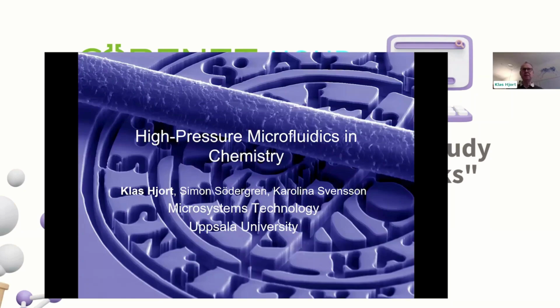So, thank you for inviting me, and it's a pleasure to be here and talk about high pressure microfluidics and chemistry. Just like Manuel said, this is nothing you do with PDMS. You need a stiffer and stronger material, very often using silicon, and you're using the mature technologies that have been developed. You have to remember, in miniaturized and microsystem technologies, all the sensors and actuators, well, at least more than 90% today are made in silicon, although most of us in science and engineering at the universities work with other materials. So my background is a material scientist.